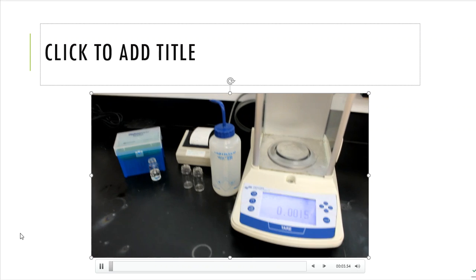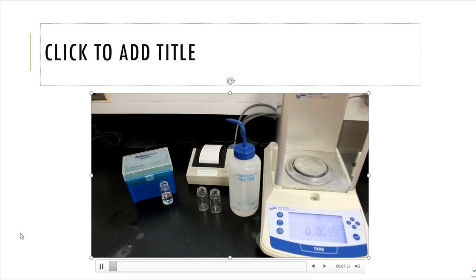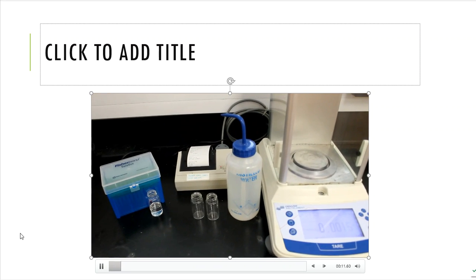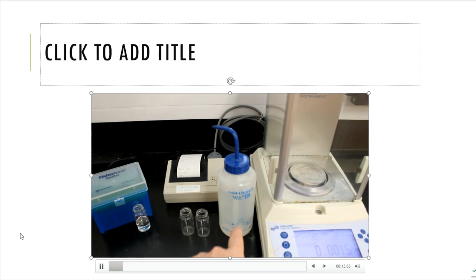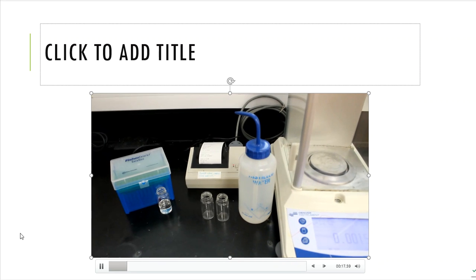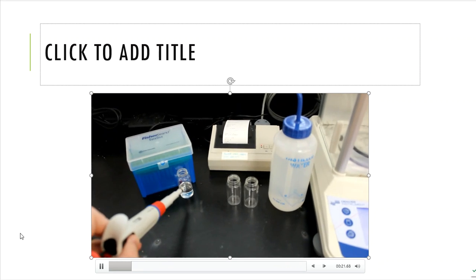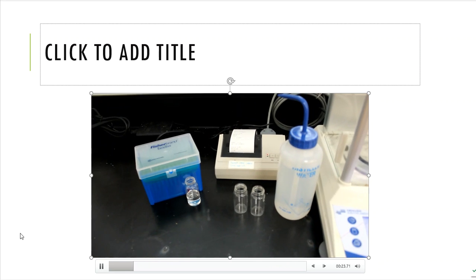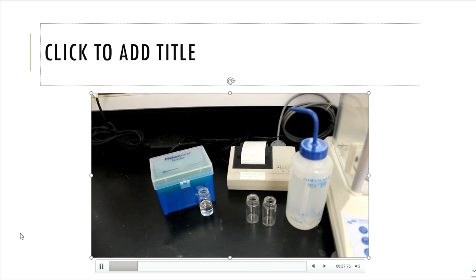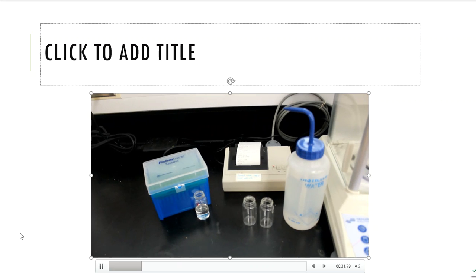All right, guys, so this is part B of the experiment. Part B is going to get you to measure the density of water just to make sure that you can actually use this system the right way. Here you're going to see a bottle of DI water that I'm going to be using. After that, they want you to determine the density of an unknown solution. Right here in this container is an unknown liquid for me. I'm just going to measure that, report the density, and try to match that density value up to a list of possible compounds.